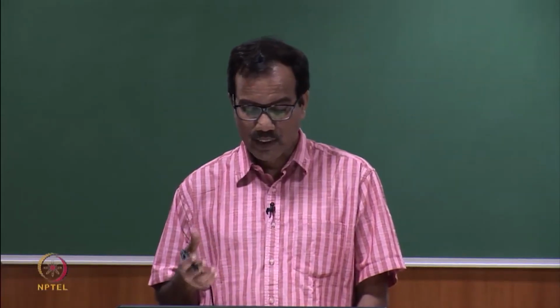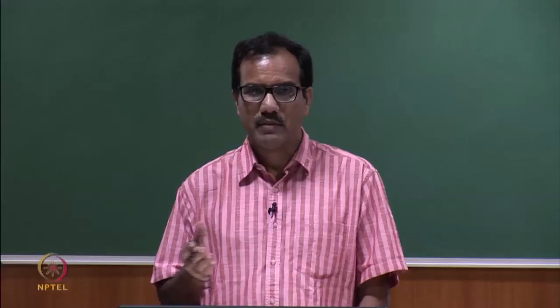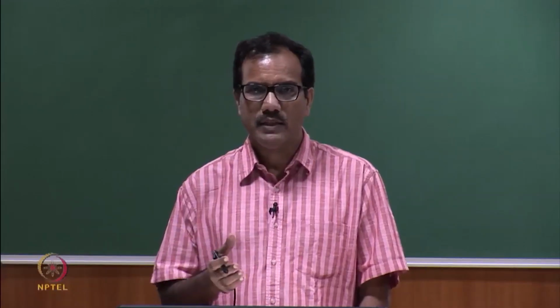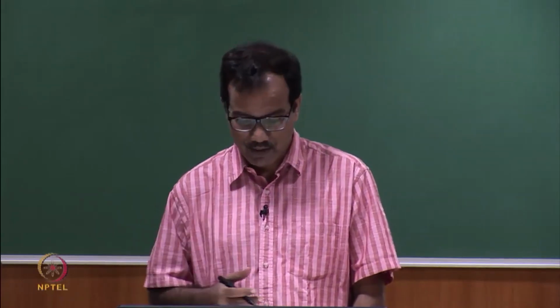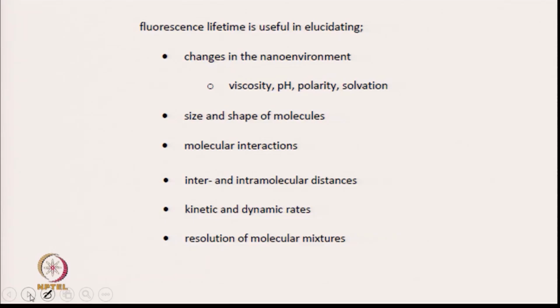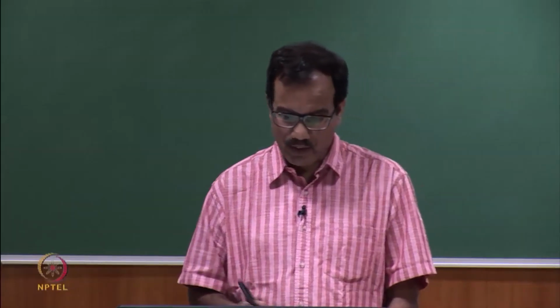It also gives you inter and intramolecular distances. Again, this can be done by measuring transfer efficiency using lifetime measurement. And then we can also see the kinetic and dynamic rates. We can get the resolution of molecular mixtures using lifetime measurement.